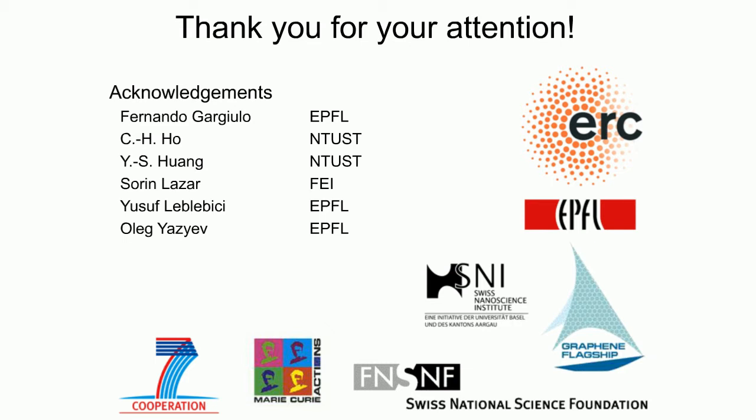What is the best metrology technique to characterize the defects in 2D materials such as graphene? So I can probably take that on. Priority-wise, probably the best would be STM, because you have a better shot at seeing the individual pieces. Then I would say probably second would be lateral. You saw those really nice results from the work that I showed.